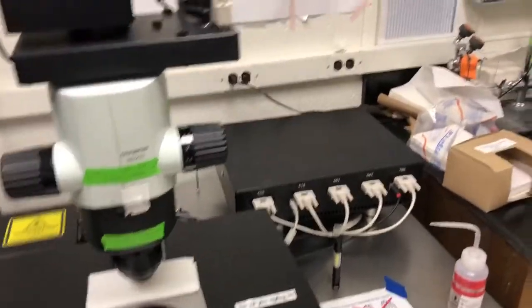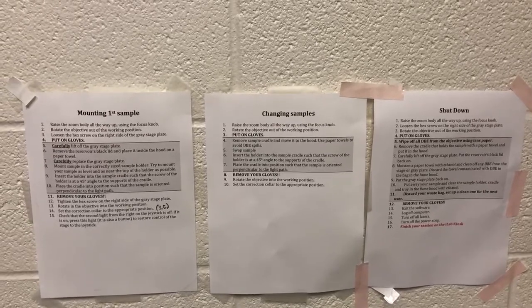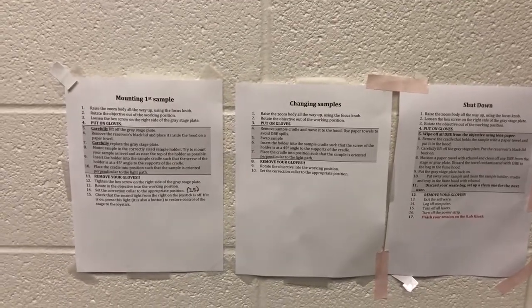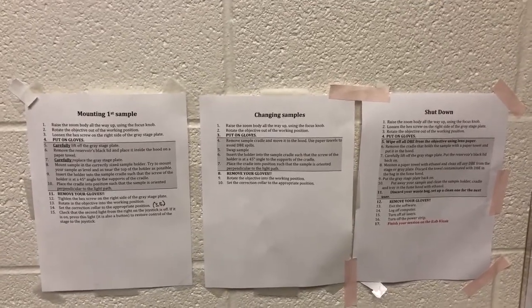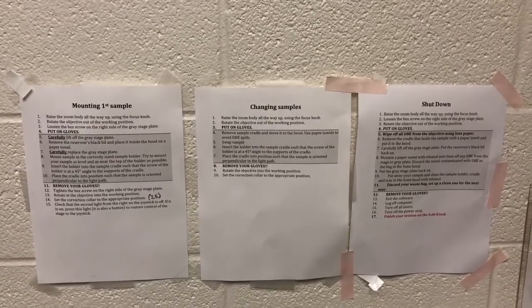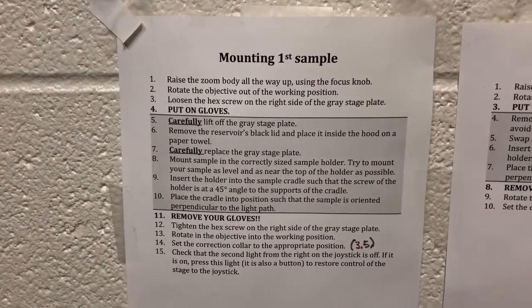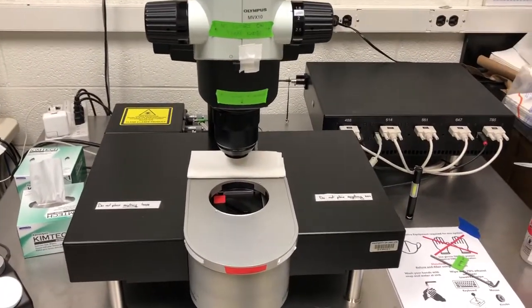To keep track of when to put on gloves and when to remove them, for mounting samples, changing samples, and shutdown we have detailed instructions on the wall. These instructions are designed to minimize the number of times you need to put on and remove your gloves. Gray blocks in the instructions indicate steps to do with gloves; everything else is without gloves. The last instruction before a gray block is to put on gloves, and the first instruction after is to remove them. Observe the glove rule to keep yourself safe.